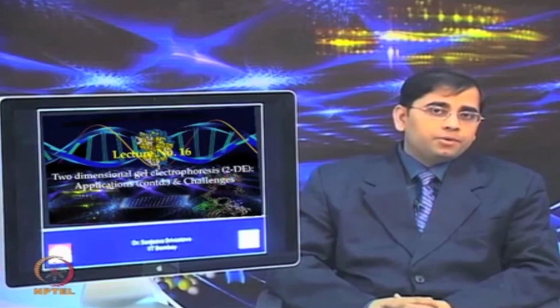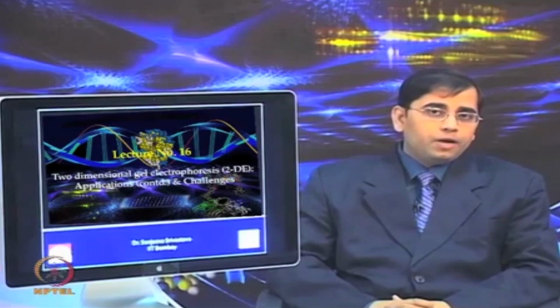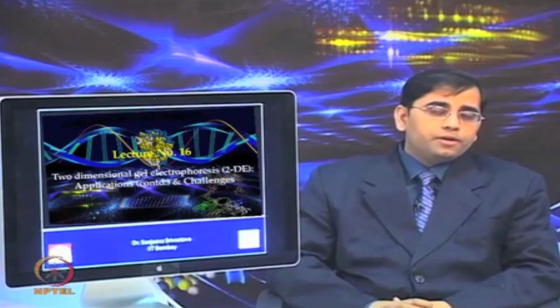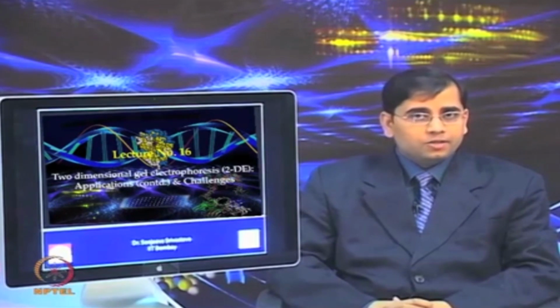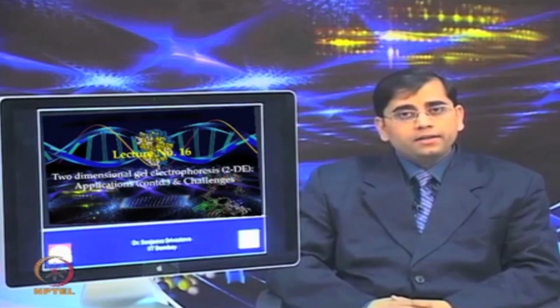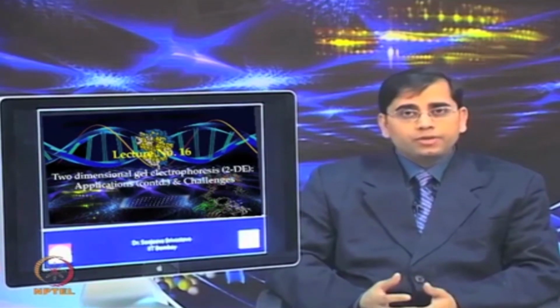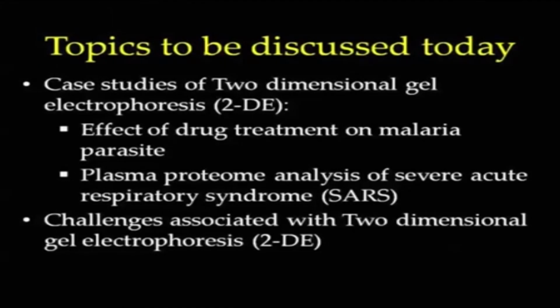I started discussing two-dimensional electrophoresis applications in the last class. I gave you an overview of the 2D at that time. So, let us continue today's lecture from the same theme, and let us discuss some more case studies on how people have employed two-dimensional electrophoresis, the power of this technique to resolve thousands of proteins and compare those for various differential proteomic applications. So, in today's lecture outline, first we will continue our case studies on conventional two-dimensional electrophoresis.